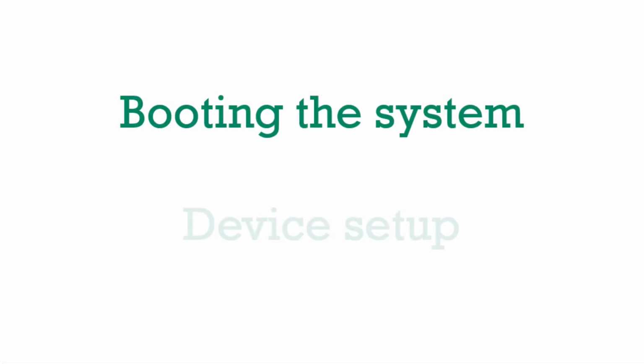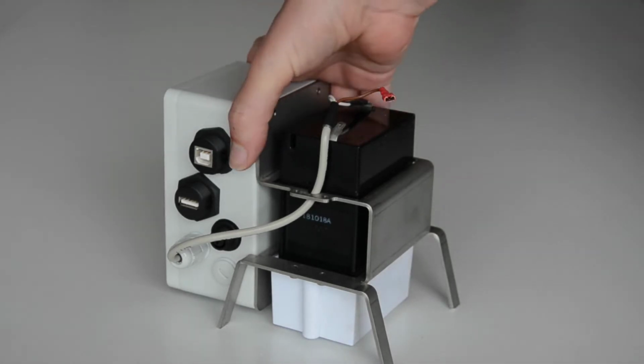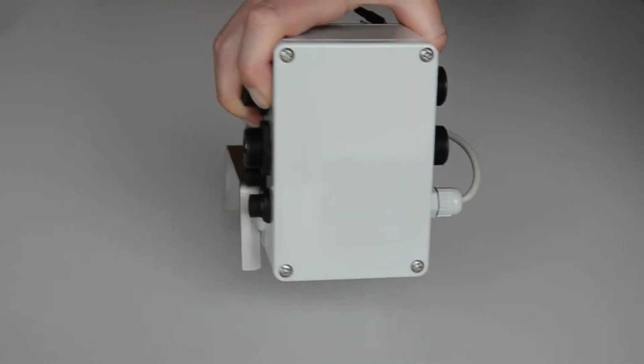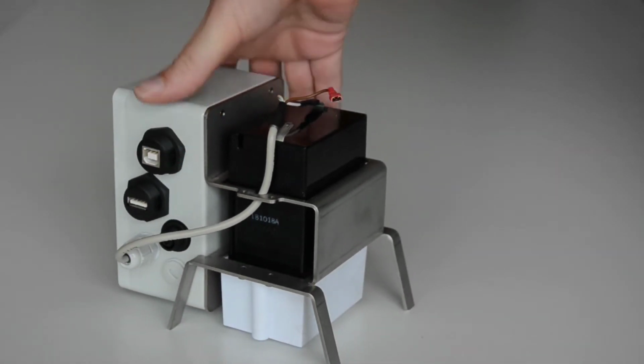Once the installations are done, the booting of the system can be started. This is the USB hub. It's connecting all the devices with each other.